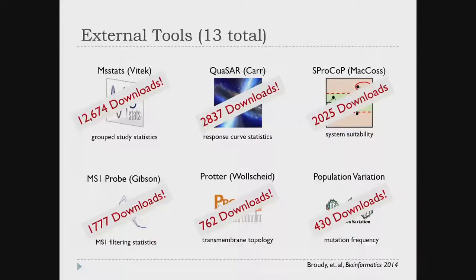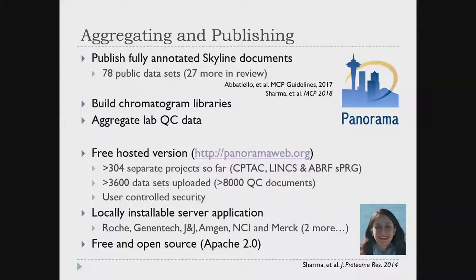We're going to be teaching MSstats here. We teach it at most of our courses, and that's partly why it's been downloaded over 12,000 times now. But there are these other tools as well. I invite you to look more closely at those.